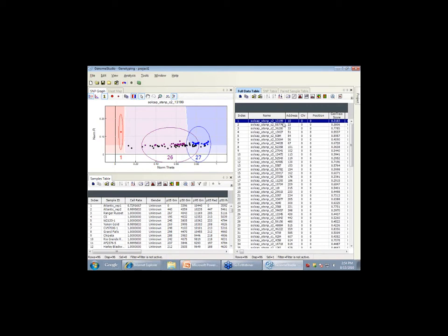They put them on an Illumina chip, and what the Illumina chip actually looks like is an array, like a glass slide, and in one well, so to speak, or one pin, in this case there are 96 SNPs. So you add one sample of DNA, and it will interrogate 96 SNPs.